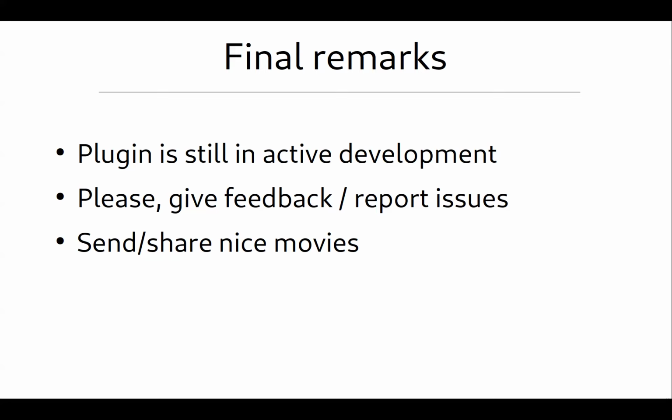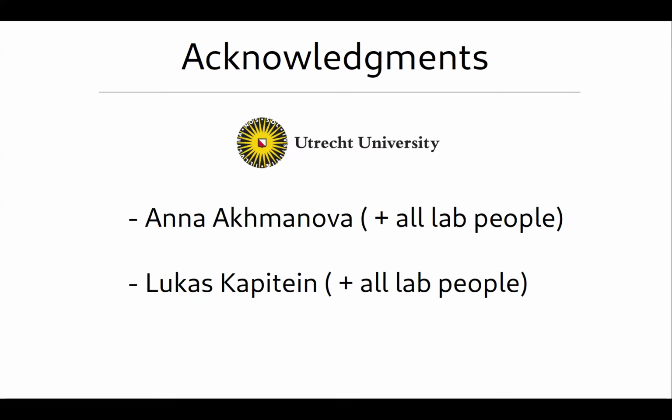I really appreciate any feedback and issue reports. If you're using it and you get frustrated with something, don't just give up. At least write something to me on the image.sc forum or in the issues. And if you do have some nice movies, feel free to share with me or not. It's just up to you.